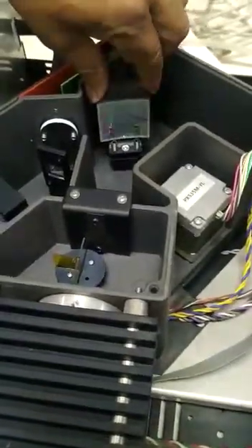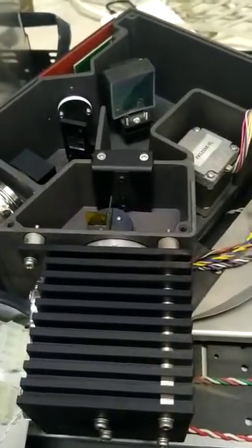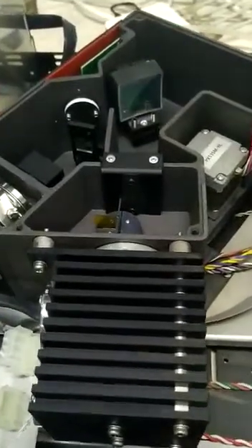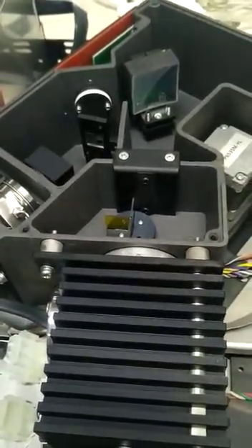Wrong position. Wrong position. I will start. Filter. Filter is moved? Yes. This is right.